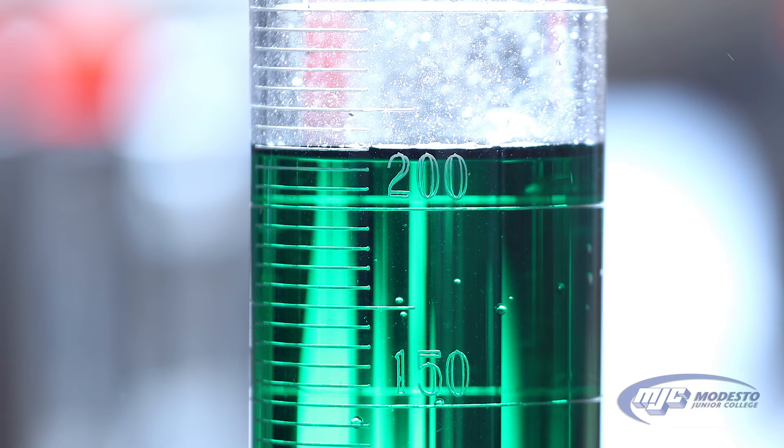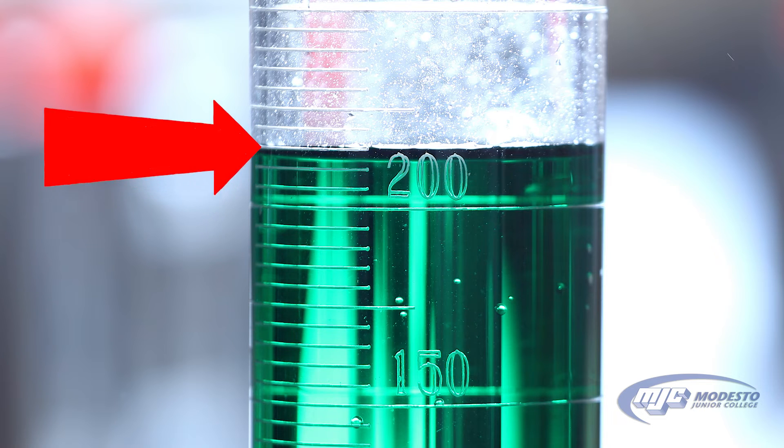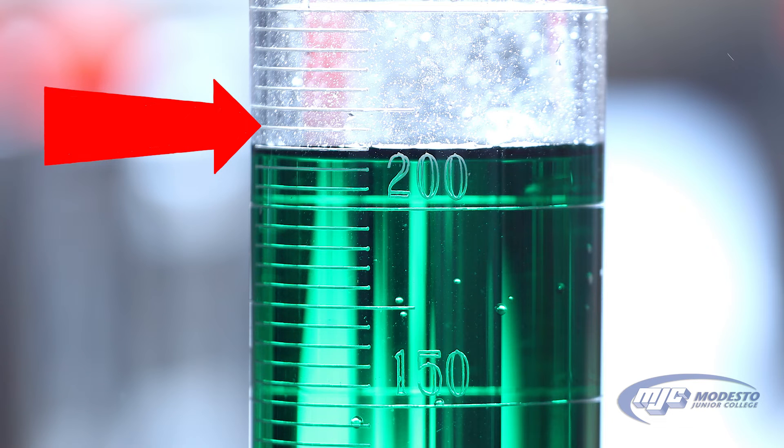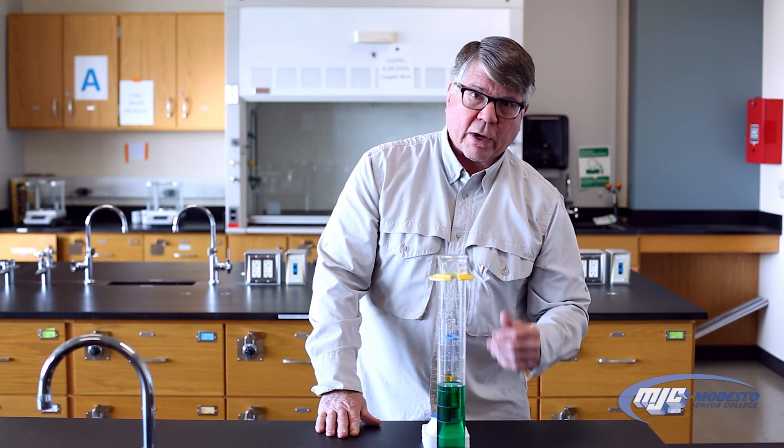Reading this large graduated cylinder — zooming in — it's between 200 and 250. The closest marks are five milliliters apart, so starting at 200 and going up: 200, 205, 210, 215. The bottom of the curve is not quite at the 215 mark, it's a little bit below, so we would call that volume maybe 214 milliliters or maybe 213 milliliters — it's your call, whatever you think it's closest to.